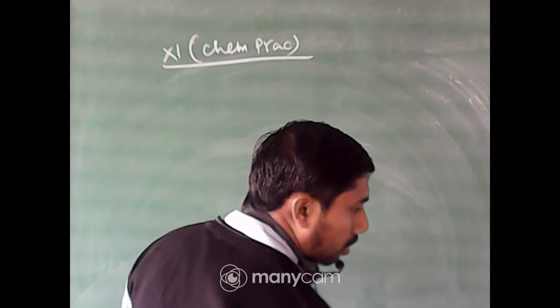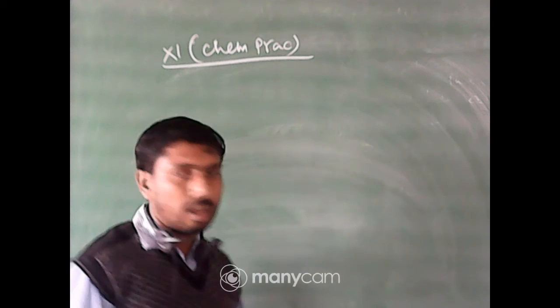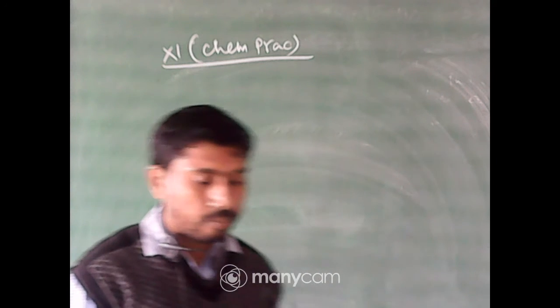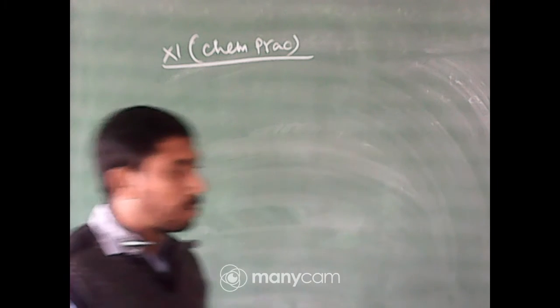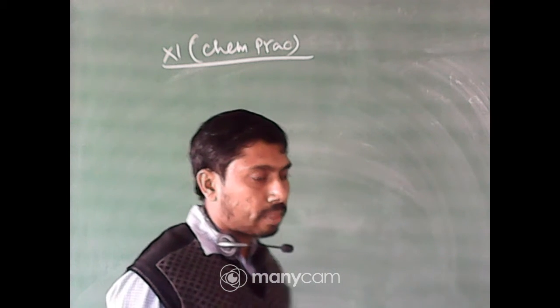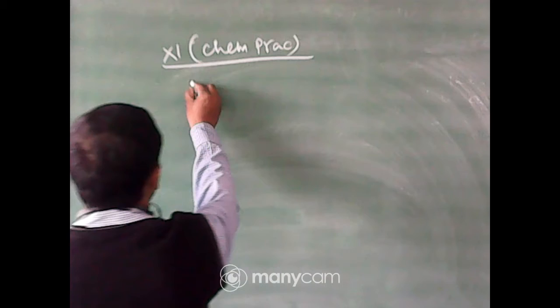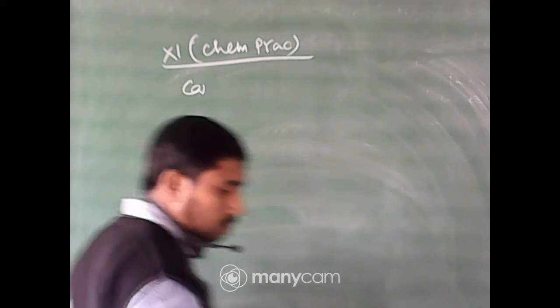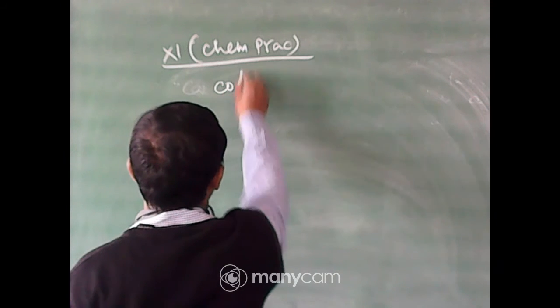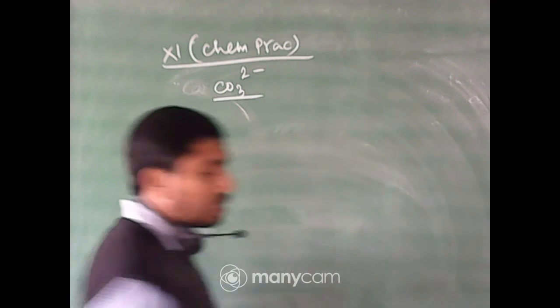Test for the acid radicals. Now, which acid radicals do you have? Do you know? Name some acid radicals in your practical. Okay, carbonate. Now, carbonate. Now, what is the test for carbonate?